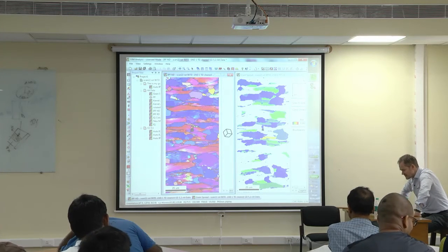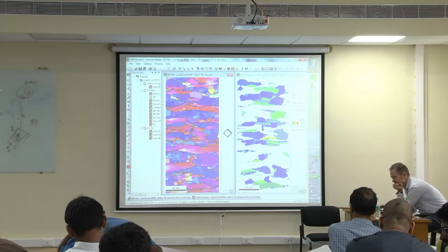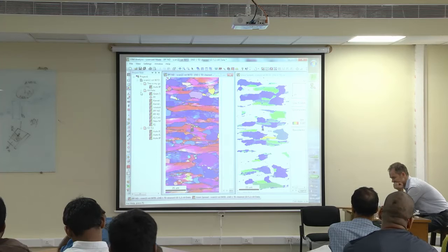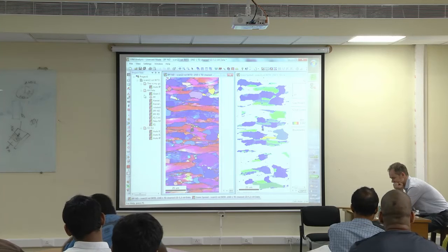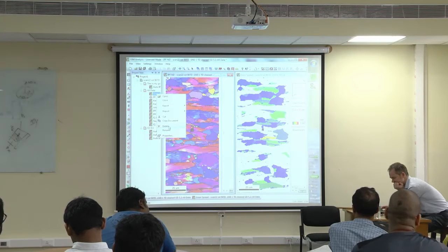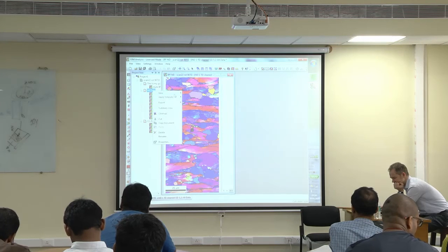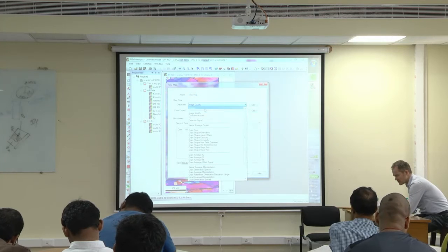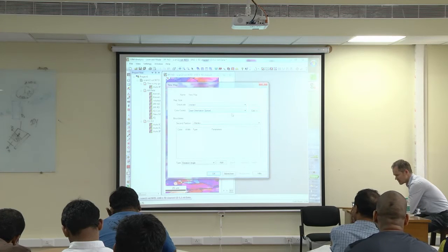That's not supposed to be like that. Yeah, maybe the software has some internal selection. I'm quite surprised about that, but delete that again. This one we delete as well. Strange. Take that off. Grain orientation spread. Okay.